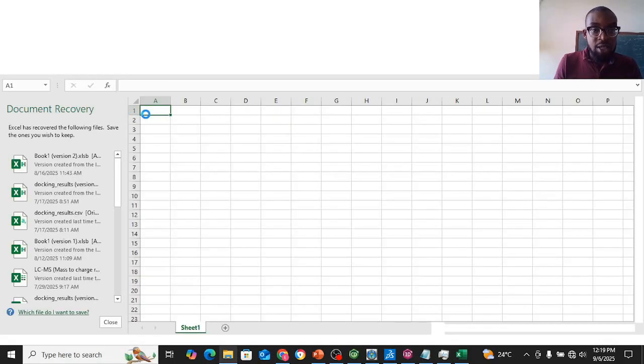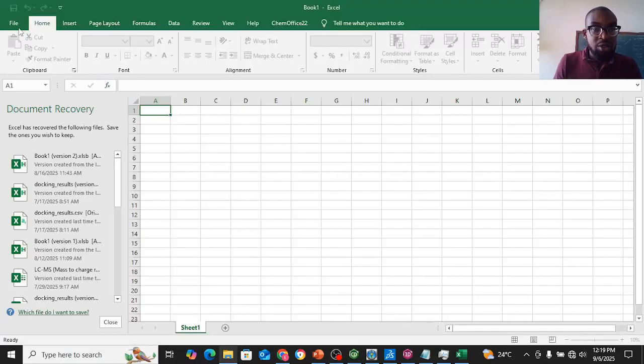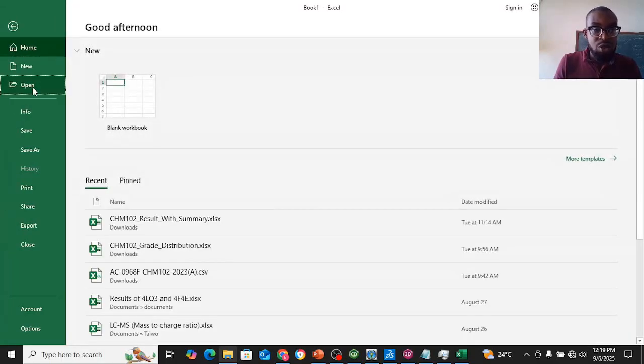You can go to Excel and then navigate to that directory.